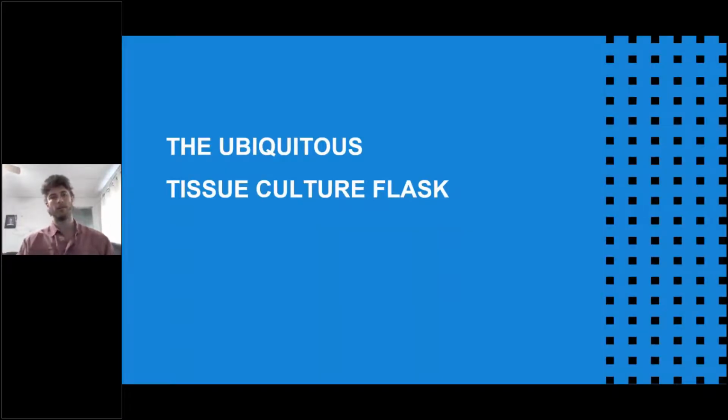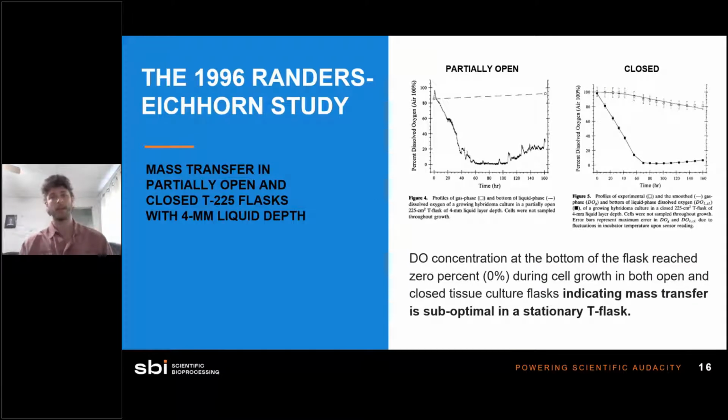So now I'll talk a little bit about the T-flask, something that everyone is familiar with. I just want to talk about some common misconceptions, or some cell culture myths, if you will, about the T-flask. Here's a study using two T225 flasks in parallel in a CO2 incubator.